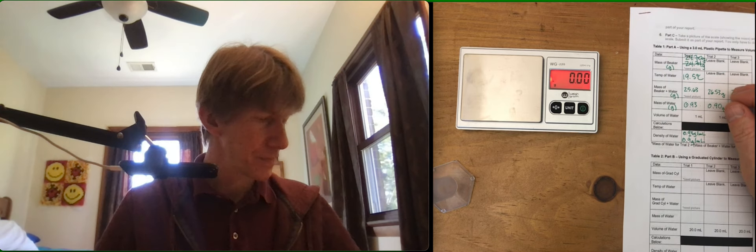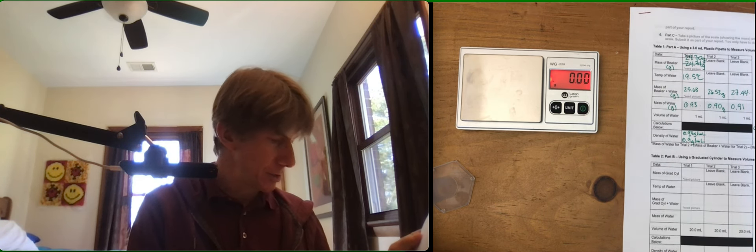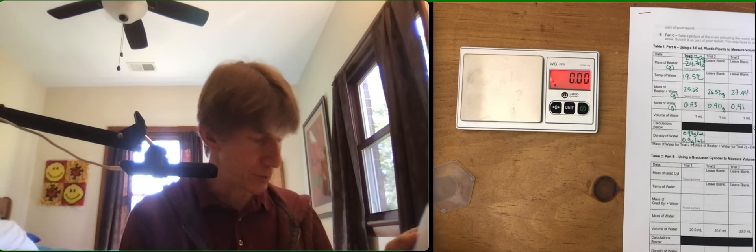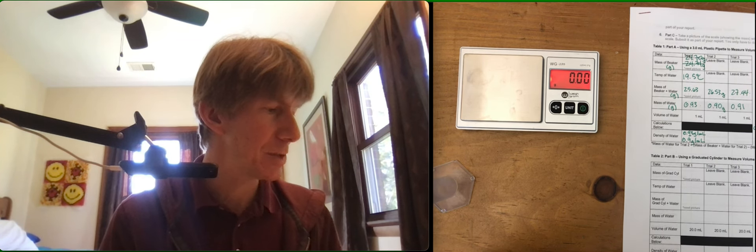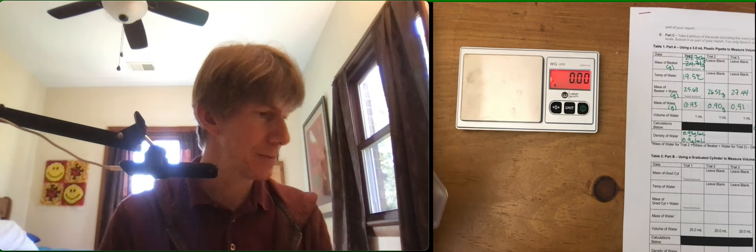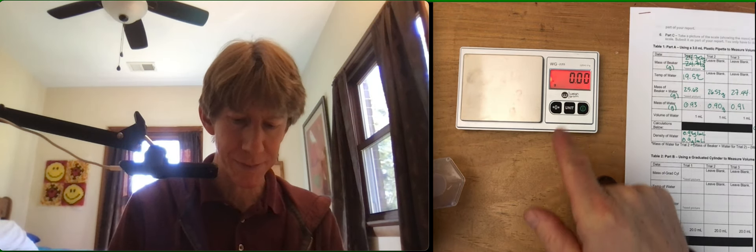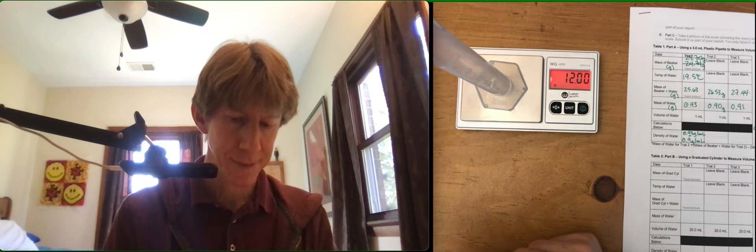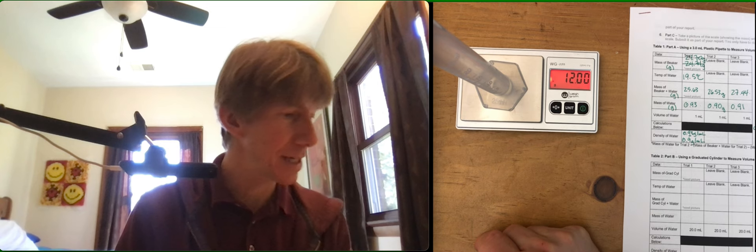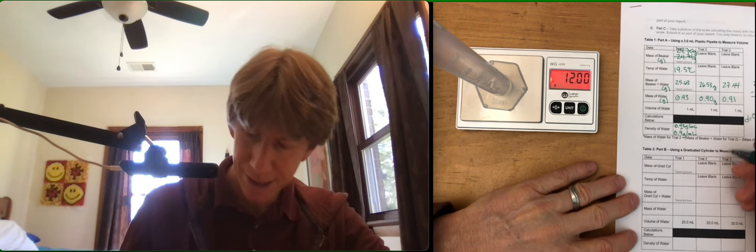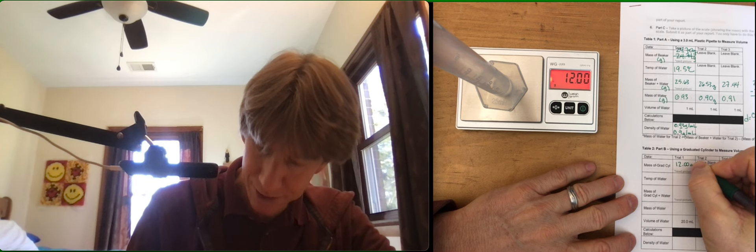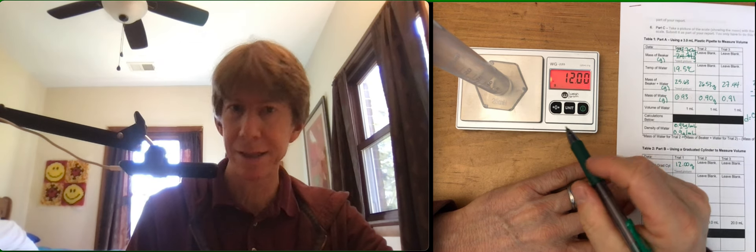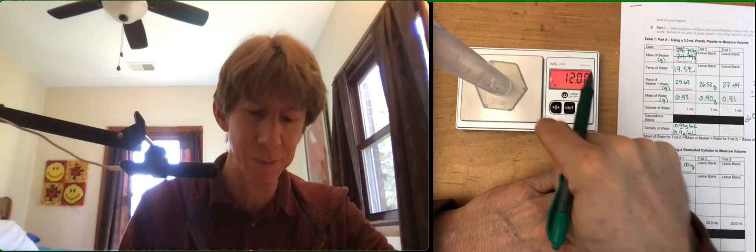Procedure part B is going to be using a graduated cylinder to measure volume. Record the mass of the clean dry 25 millimeter graduated cylinder. I just happen to have mine right here. I've got my scale right here. The dot just came up. Take a picture of the scale. 12.00, that number is going to go right here: 12.00 grams. My camera is recording this second screen here, so please take a picture of that part.